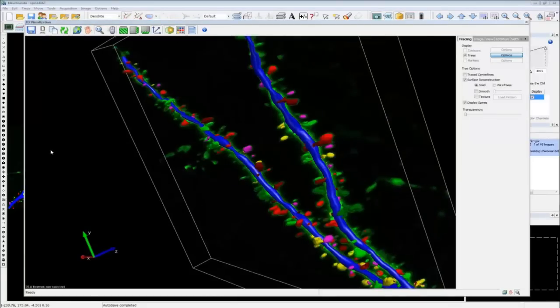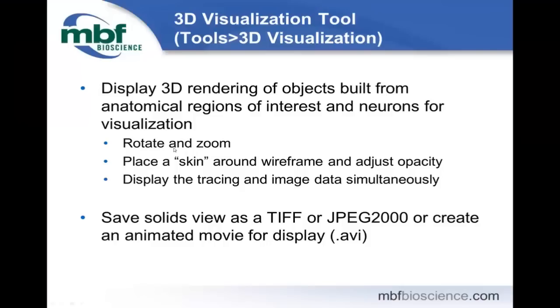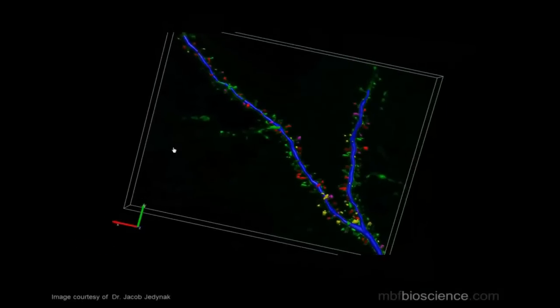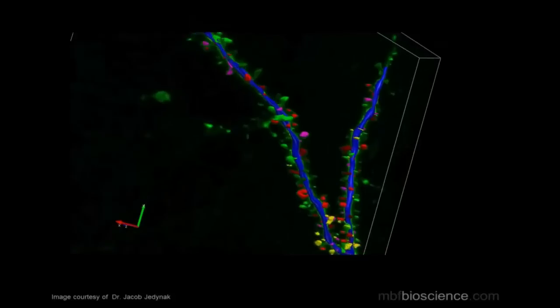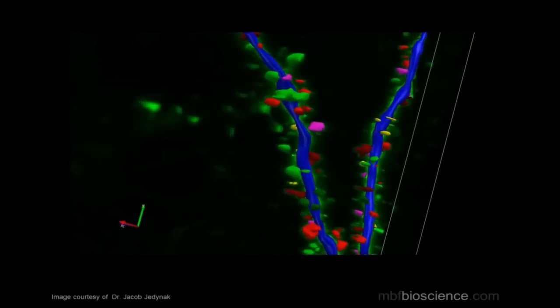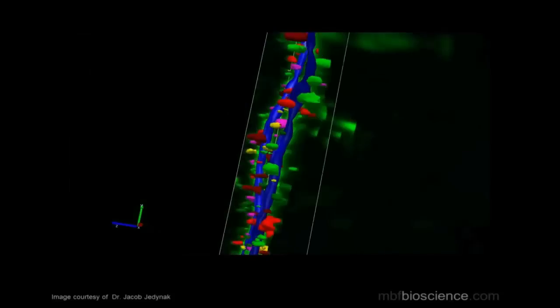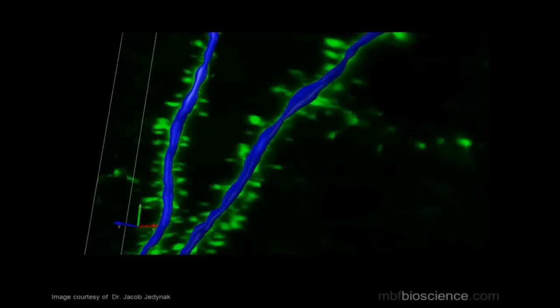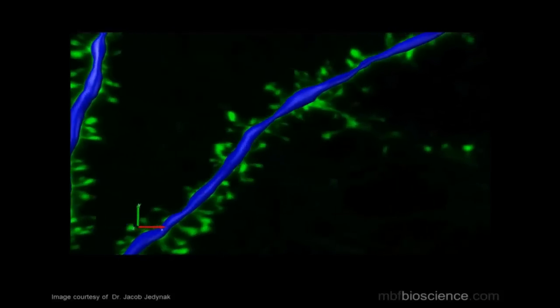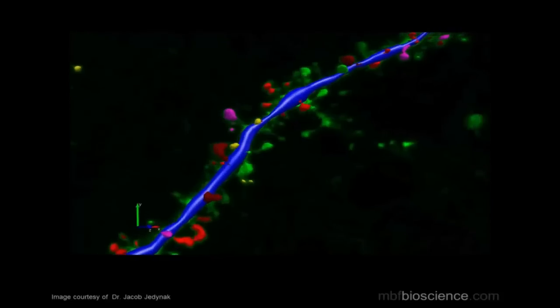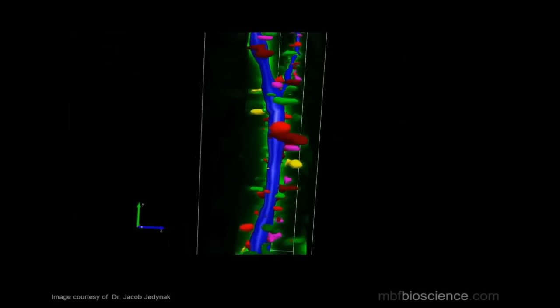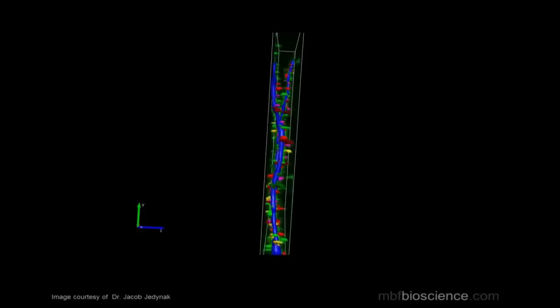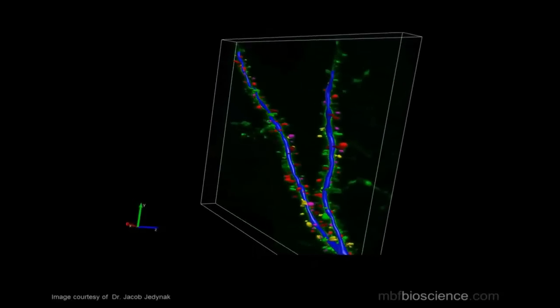Here's a movie made in the software with similar data: zooming in, turning spine information off and back on, then zooming out. You can remove the tree by unchecking the tree option next to the traces, turn on and off the bounding box — those white lines — so the reconstruction appears in space without specifying the volume boundaries. You can also turn off the image data entirely.